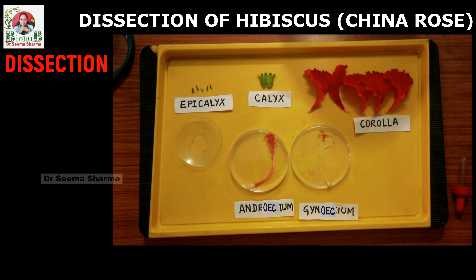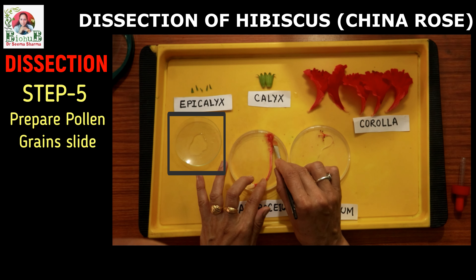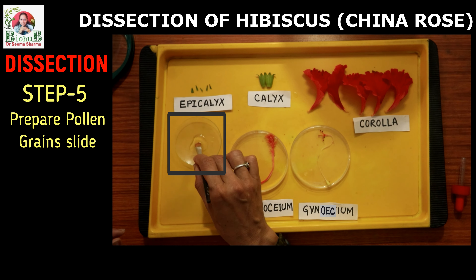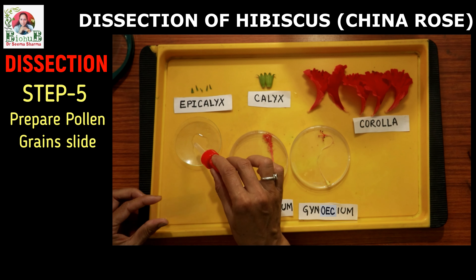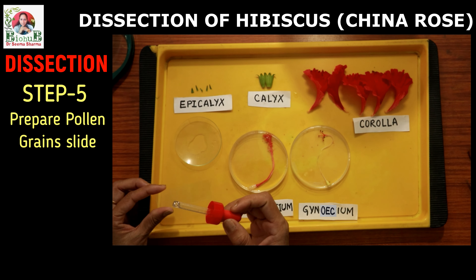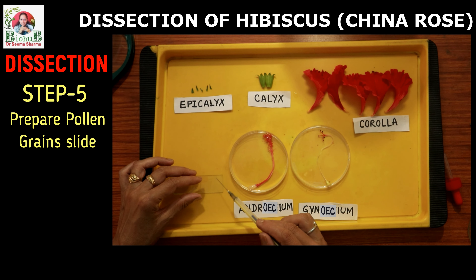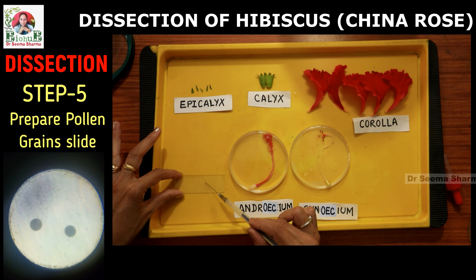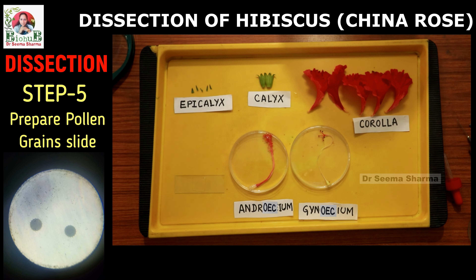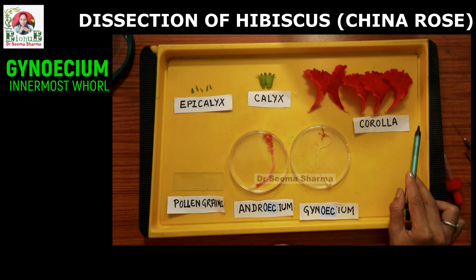During practical class as well as in exams, you have to make and show a slide of pollen grains. For this, take water in a watch glass, rub a wet brush on the anther-containing part of the stamens, and dip and dust it in the water in the watch glass. Take one drop of this on a clean slide, put a cover slip, and observe under the microscope. You will be able to see numerous dark mustard-yellow colored globular pollen grains with spike-like outgrowths.